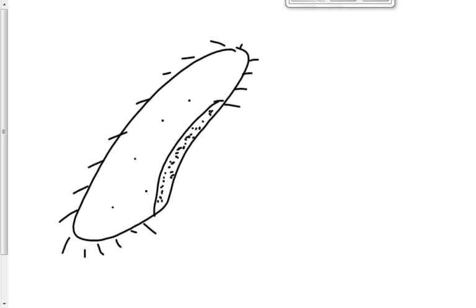This is lighter. Okay, there's usually a nucleus in here and a nucleolus, and that's very dark, and this is kind of dark. Okay, but you don't have to be a good artist. I'm not, obviously. It just has to generally represent the shape of the organism you're looking at. I am not going to be marking you on your artistic ability.